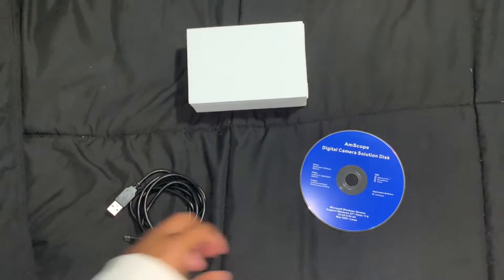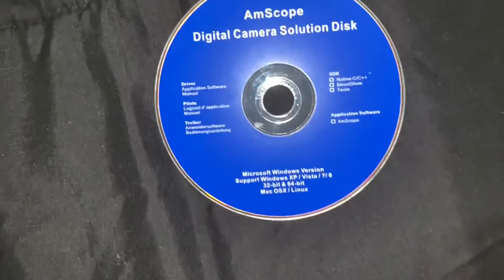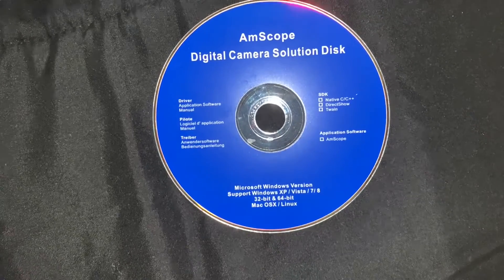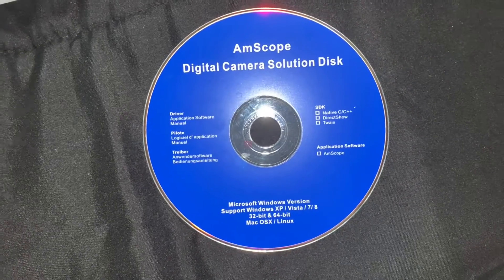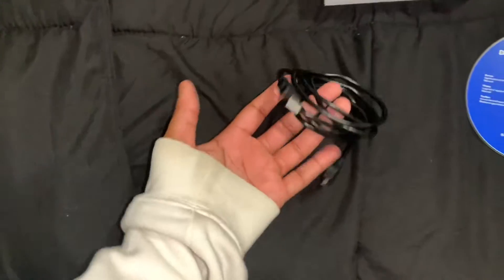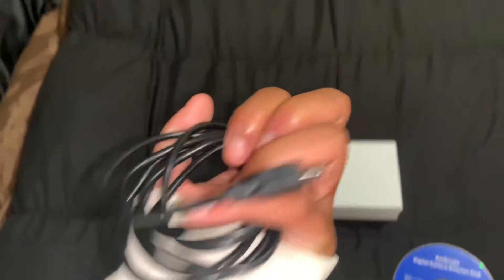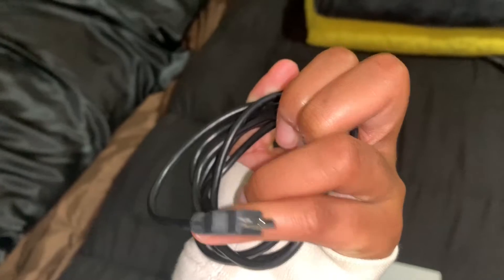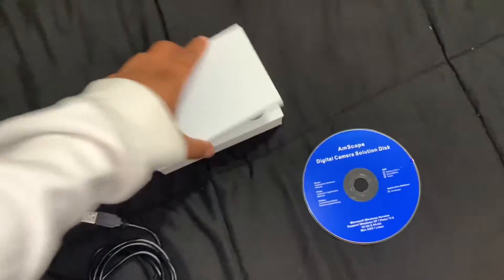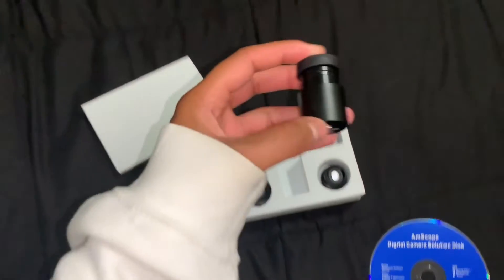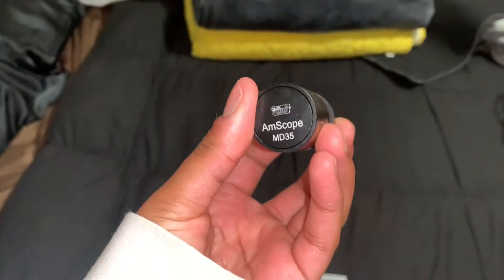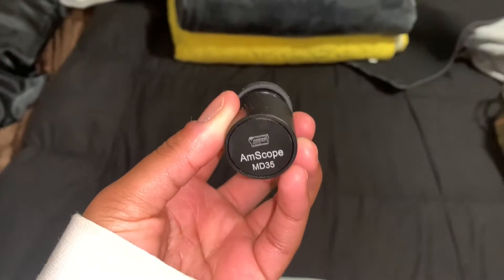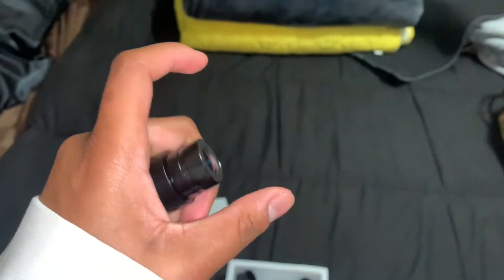Hey Blaze family, so we have three major things that we need. One being the Amscope disc that we'll put into the DVD player to install on the computer, the microscope cord, USB cord that we'll put in the microscope and connect it to the computer, and we also have the camera, which will be the .03 Amscope MD35 camera.